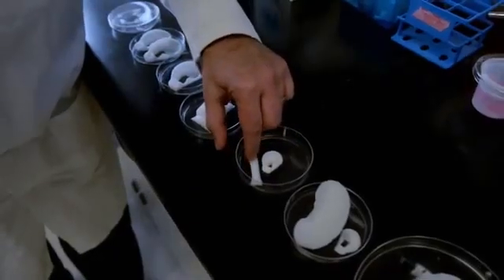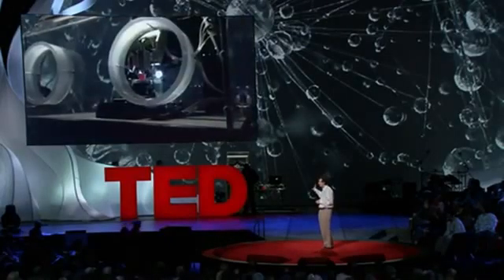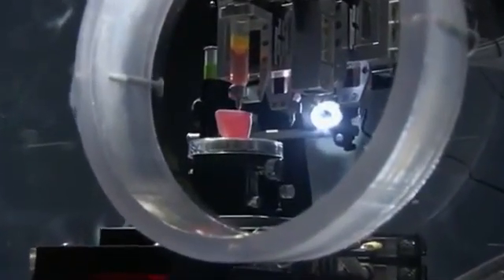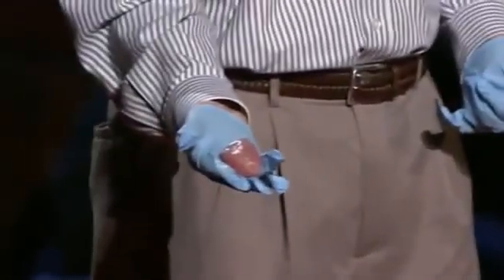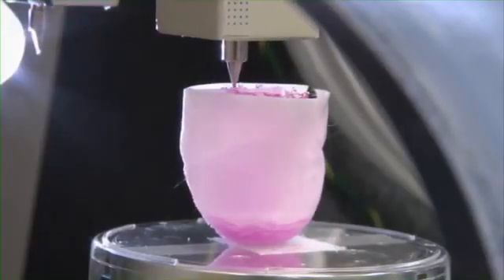Dr. Atala has specialized in regenerative medicine since 1990. But it wasn't until this TED Talk 2 years ago that the promise of building body parts caught fire. 90% of the patients on the transplant list are actually waiting for a kidney. You can actually see the printer back here, and that's been printing this kidney structure that you see here. Here it is. You can actually see that kidney as it was printed earlier today. While implanting kidneys like this is still at least a decade away, it holds the potential to revolutionize organ transplants.